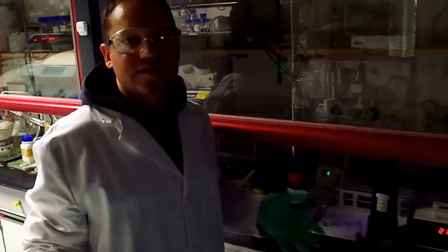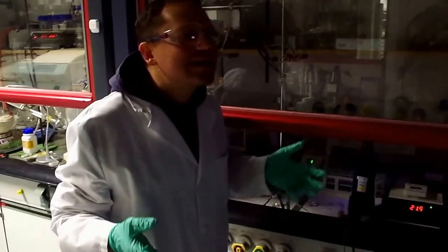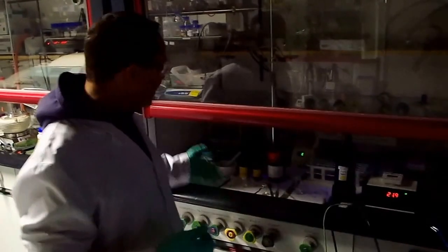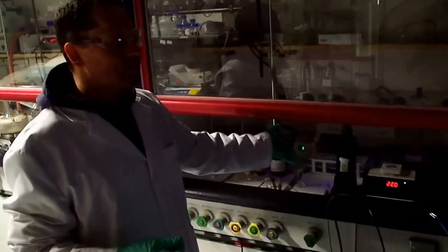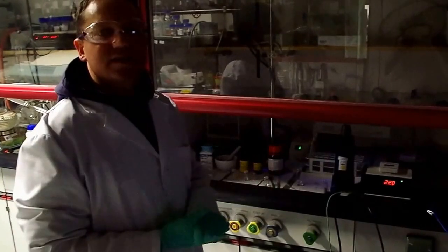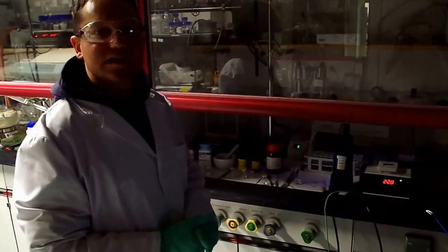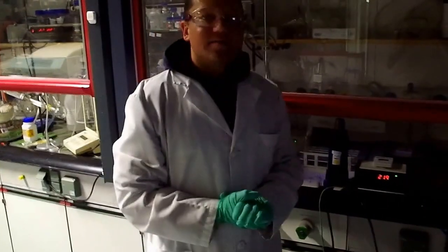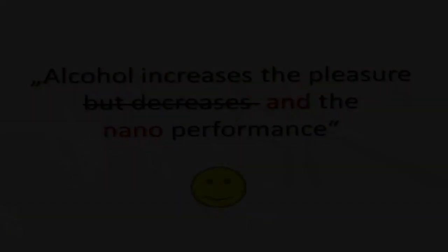It's pretty cool that you can make cadmium sulfide nanocrystals, whose surface is very sensitive, you know. Mostly they look orange because they have defect states, so in an easy way you can synthesize cadmium sulfide nanocrystals with this luminescence, without defect luminescence, without this orange, and with these nice absorptive features. Okay, let me summarize my results.